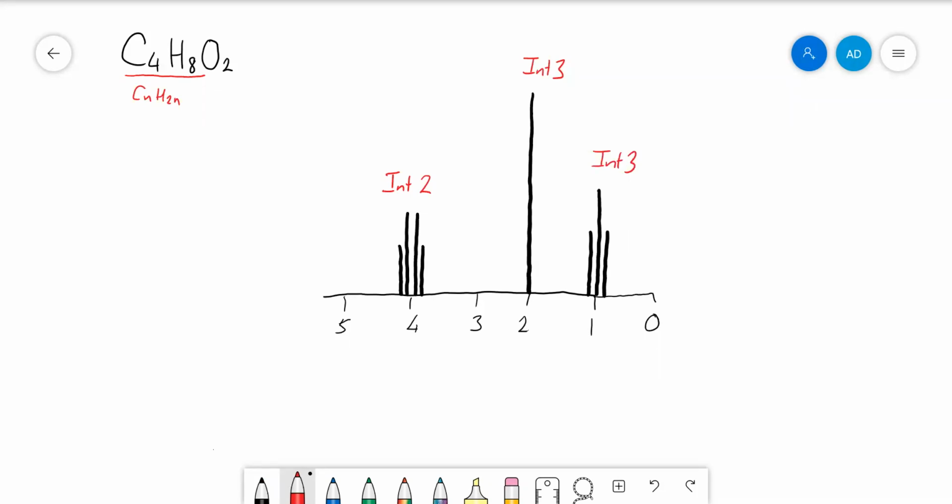They will never give you a whole spectrum of compounds containing carbon-carbon double bonds because they're too complicated, but it has got a double bond in it. So it must have a carbonyl group. Okay, we know it's definitely got that in it. What else do we know?